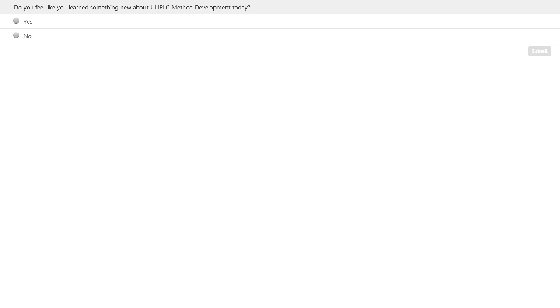So the recommended injection volume from the calculator is probably lower than what we actually will inject in reality, because we're trying to get more product from the column. So it does work, and the methods translate well. I've got some examples which I could forward on afterwards. But it doesn't have a function for overload within the calculator.